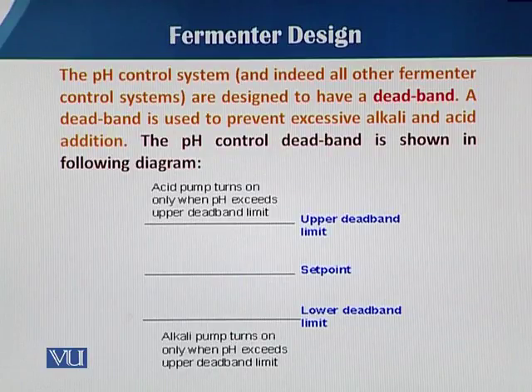Let us see an example for pH control. Indeed, all fermenter control systems are designed to have a dead band. Sometimes it happens that if we want to set the pH at 7 and the pH goes to 7.1 or down to 6.9, then there will be on and off switching. So if there is one drop of alkali or one drop of acid, that can change the pH to 7.2 or 6.8.